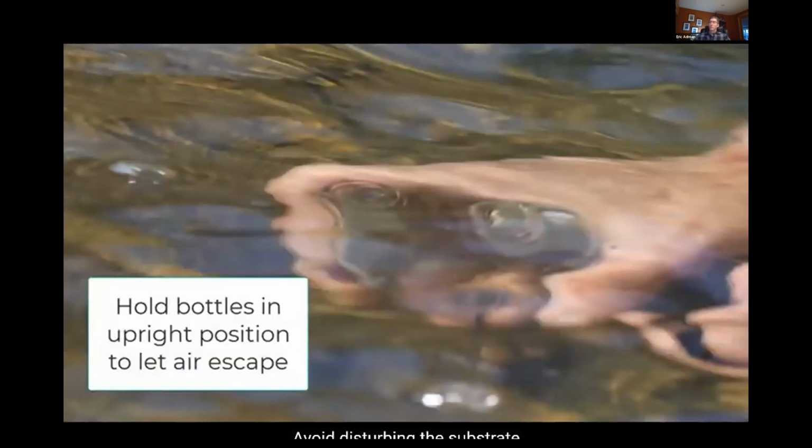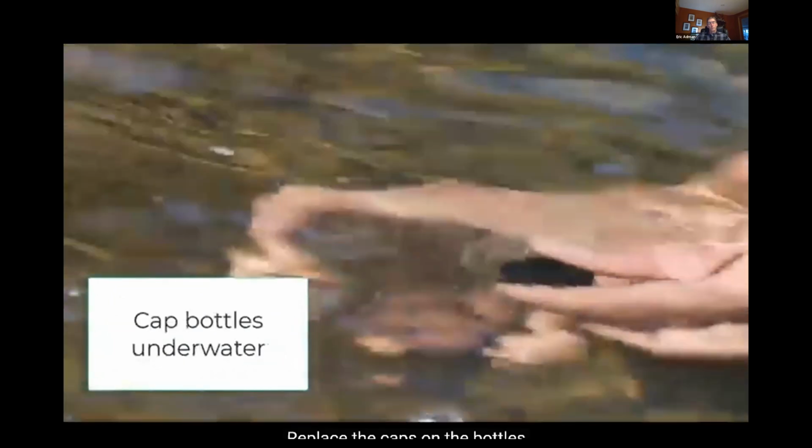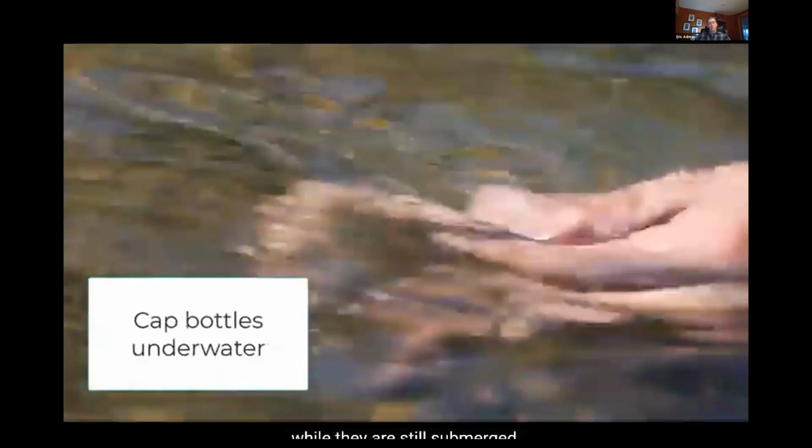Avoid disturbing the substrate or stream bottom at the sampling site. Allow the bottles to fill completely underwater. Once bubbles have stopped emerging from the bottles, move or shake the submerged bottles to allow any additional air bubbles to escape. Do the same with the caps to make sure that there are no air bubbles in the caps. Replace the caps on the bottles while they are still submerged.